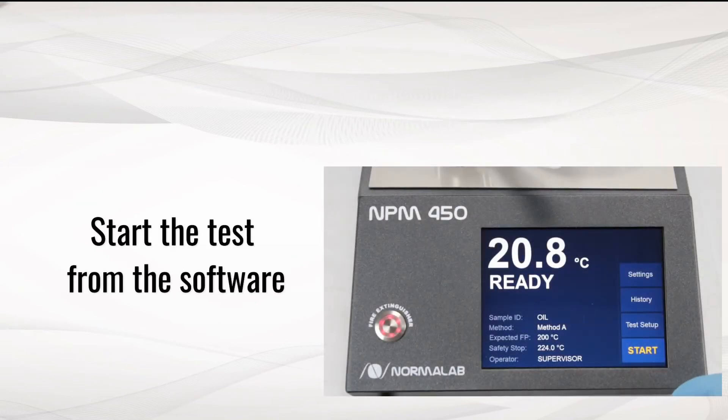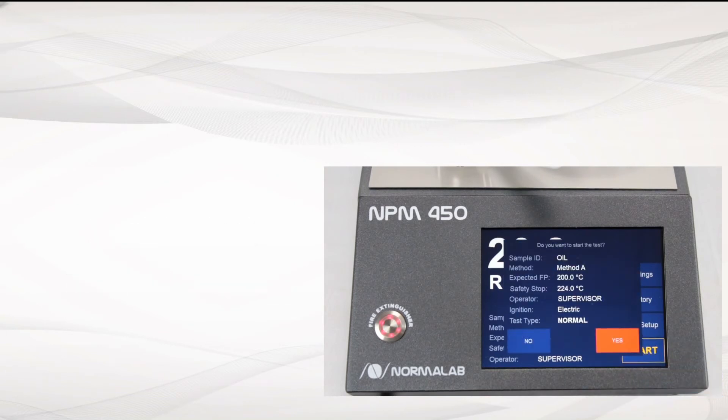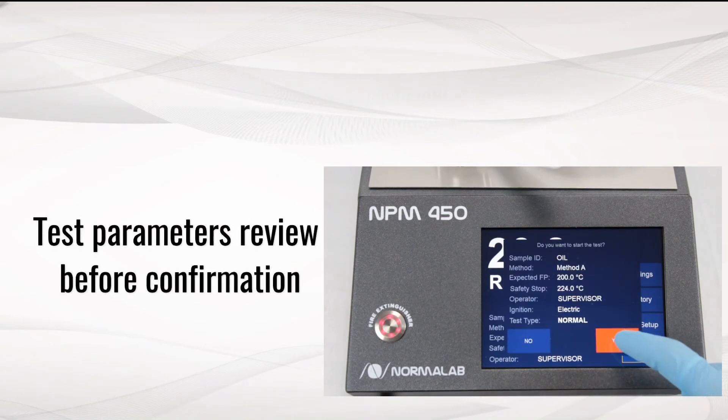Start the test from the software button and confirm test parameters review.